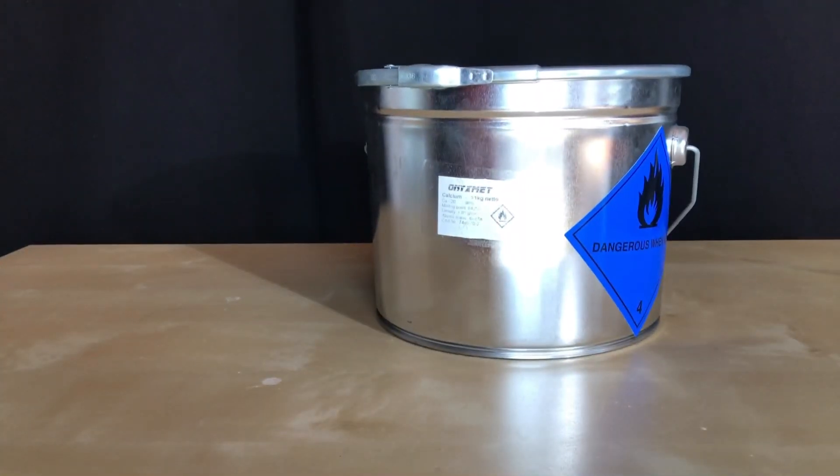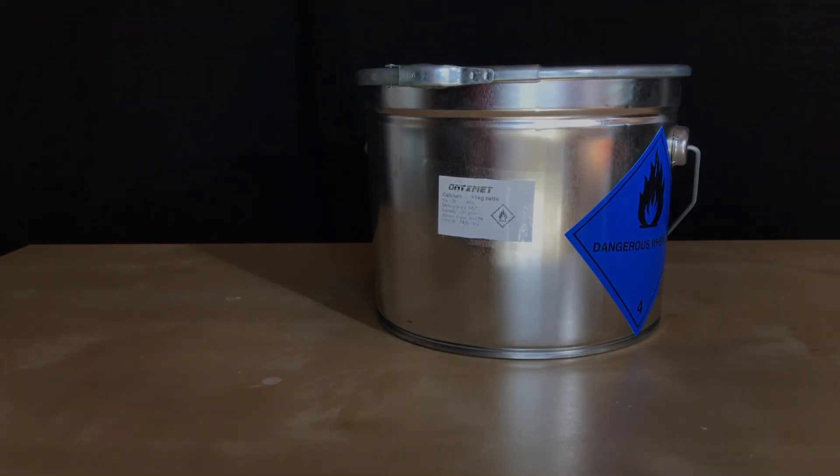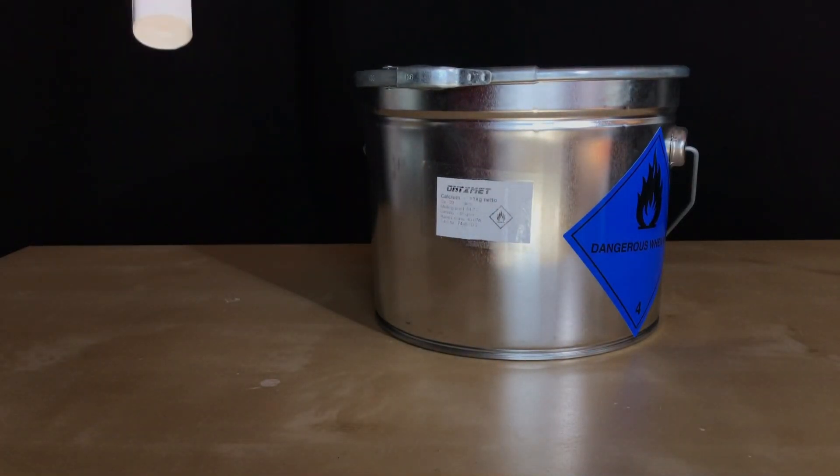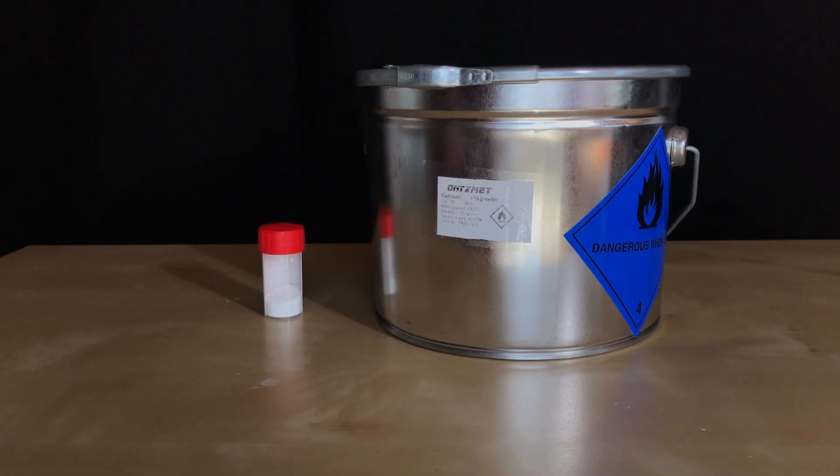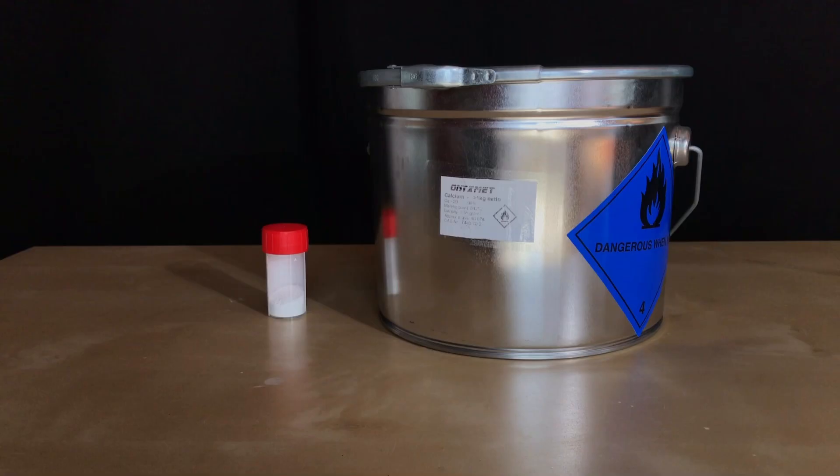Welcome back everyone. Today we are going to recover a metal from its corresponding and highly interesting oxide using a reducing agent. For this you are going to need a metal oxide and a reducing agent which is less noble than the metal in the metal oxide.